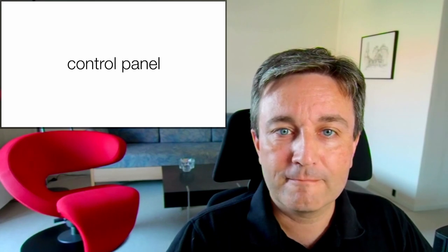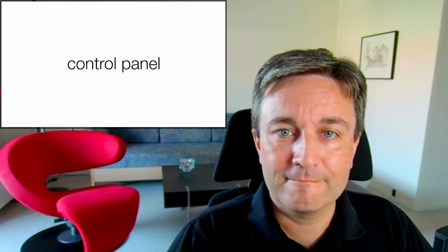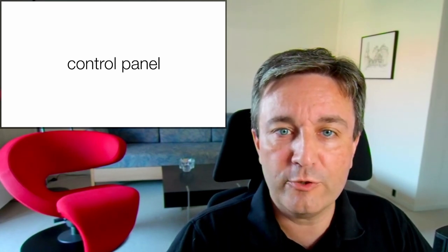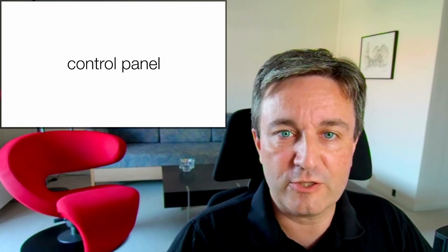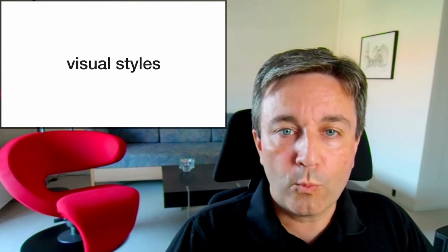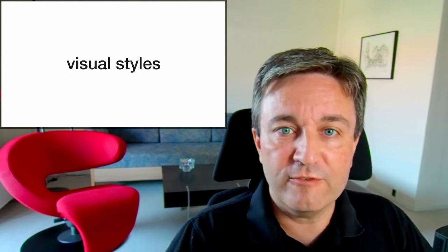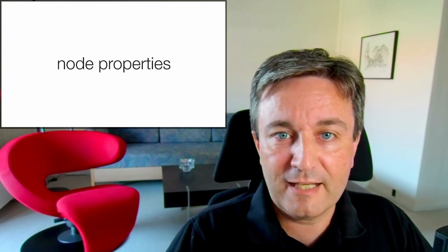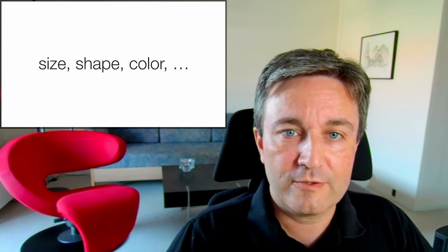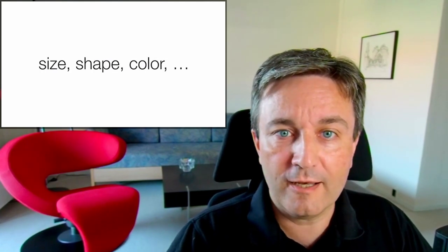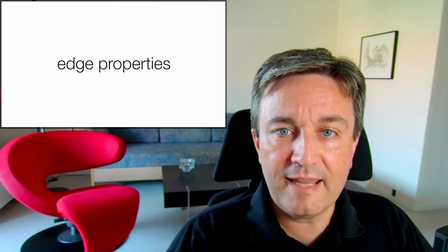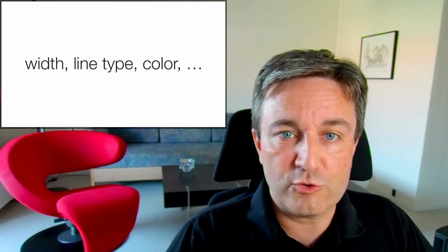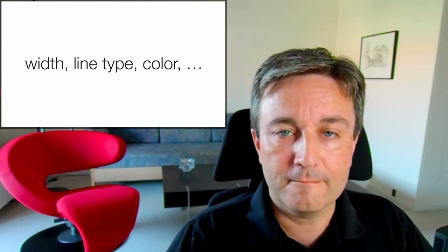To the left of these, you have the control panel. As the name implies, that's where you control most things. One thing that you will want to control is the visual styles. That includes the node properties such as size, shape and color, and the edge properties such as width, line type and color.